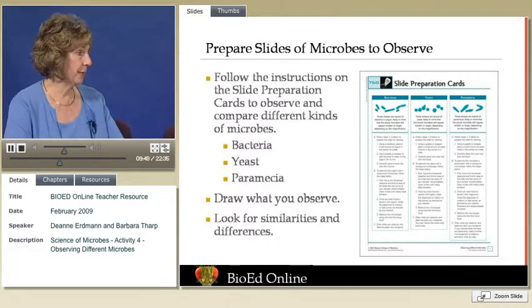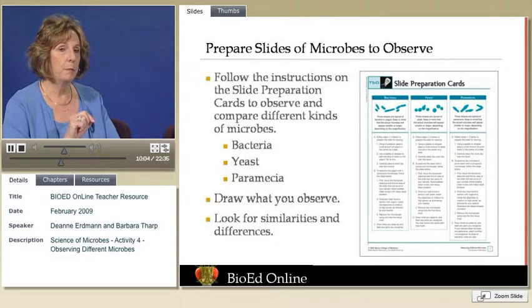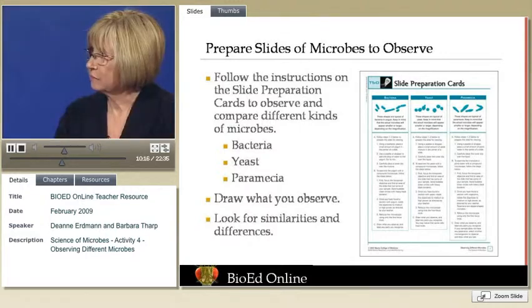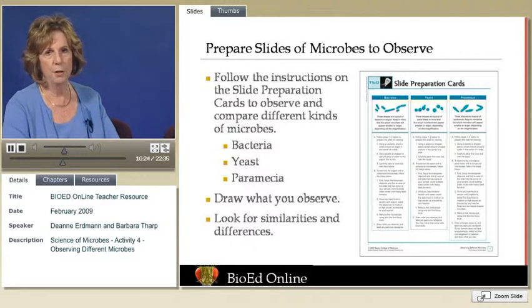Well, we're going to need to increase our magnification pretty high on this one because the bacteria that are in yogurt are really very small. They're rod-shaped, and many times they will string together. They do move around. They do have flagella, but certainly we're not going to see the flagella even if we're able to magnify it at 400. But you'll be able to see a little bit of movement, almost like little tiny dashes moving around in the yogurt. And if you've left it out overnight and you've got a good active culture, you'll see a lot of that movement.